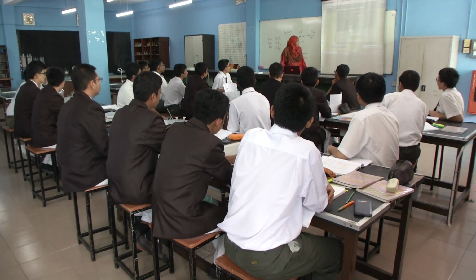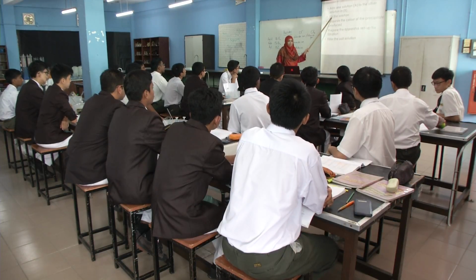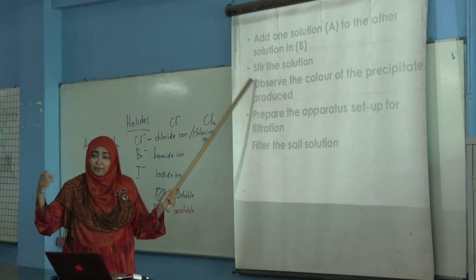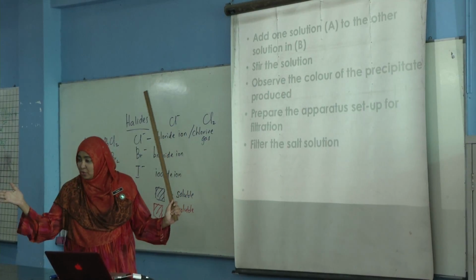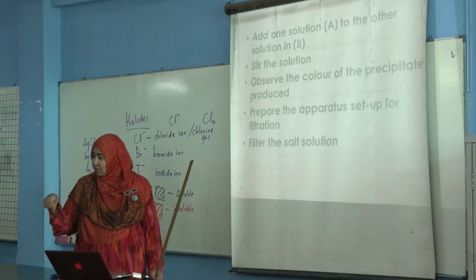So now what you're going to do is, in your basin, you have two different solutions. Now, you just add the two solutions together in a beaker and then stir. How long do you stir? Not until it dissolves. It's an insoluble salt. It's not supposed to dissolve. It's supposed to mix well. So stir about 1 minute, alright?